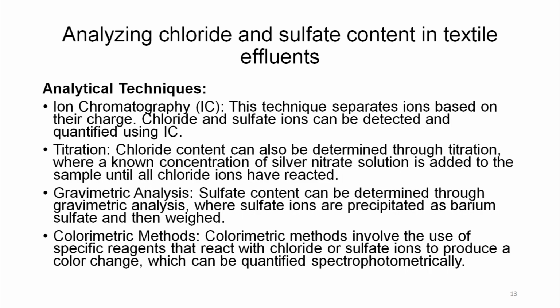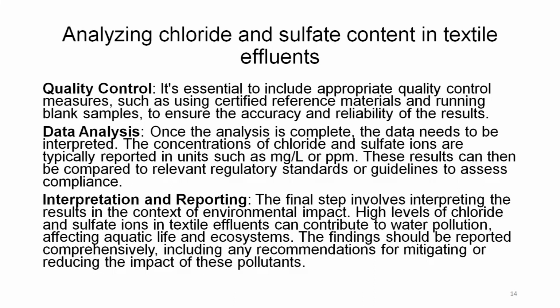Colorimetric method. Colorimetric methods involve the use of specific reagents that react with chloride or sulphate to produce a color change, which can be quantified spectrophotometrically. Quality control.